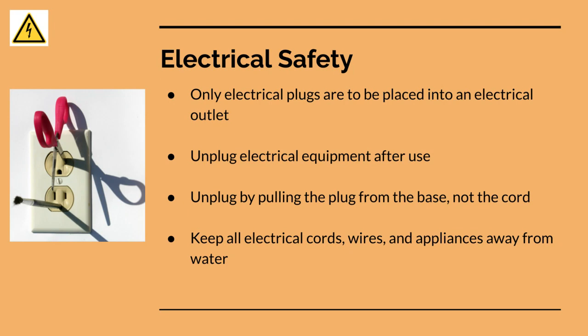Also, unplug electrical equipment after use, and also unplug by pulling the plug from the base, not the cord, okay? This, again, is normal practice you should be doing at home anyway. Okay, you pull it from the base, not from the end of the cord. That's dangerous. You're probably going to mess up the outlet, and you're probably going to mess up the prongs on your plug, which is a lose-lose situation in my book.